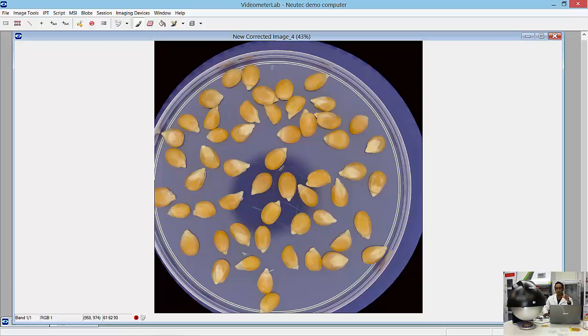So this is kind of akin to where seeds and grains will sometimes get some fungi or bacteria or some type of infection that some user would need to sit there and sift through and see if that particular sample is infected. Now, that's a very time-consuming task, to sit there and comb through it and look for very subtle changes.